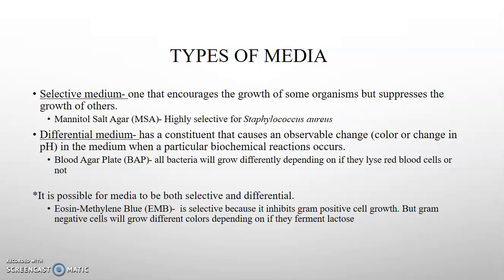Mannitol salt agar, and you can tell by the name, it has a high concentration of salt in it. Most bacteria cannot survive in the presence of salt. Salt creates this hypertonic environment where it basically pulls moisture out of bacterial cells and causes them to shrivel up and die. So most bacteria, if you put them on a mannitol salt agar, would not be able to grow. The exception to that rule is Staphylococcus.